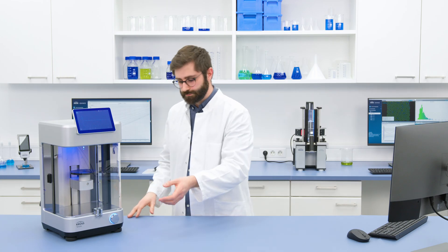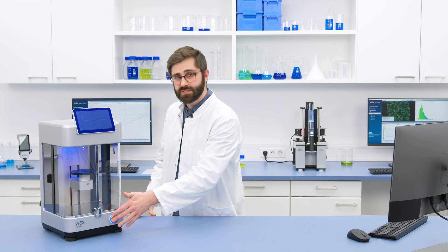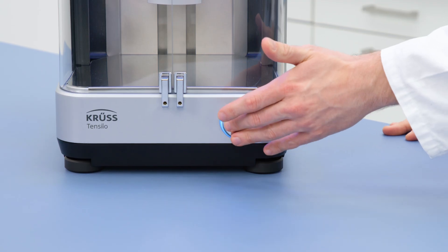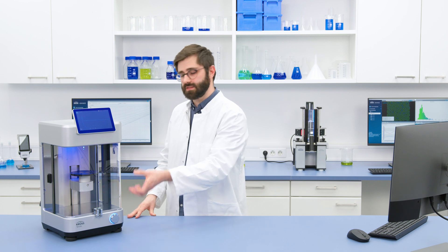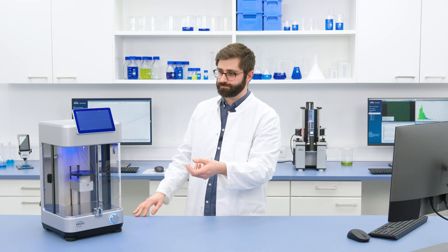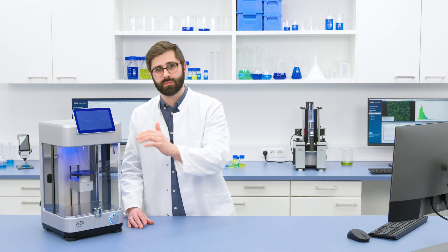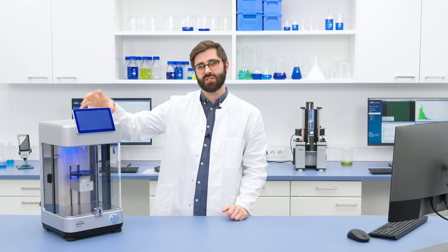Here at the front of the device we have a multi-functional dial which you can use to control the position and the movement of the sample stage very accurately. And at the top we've added a seven inch touchscreen panel.